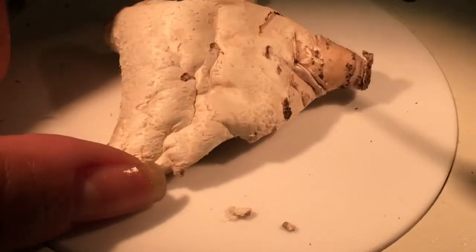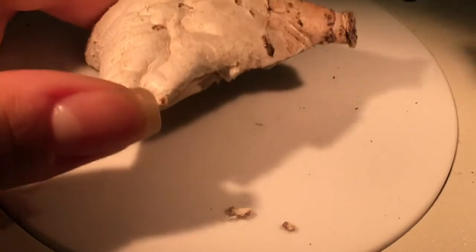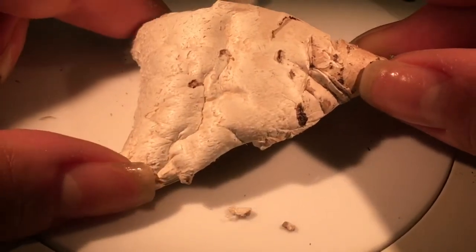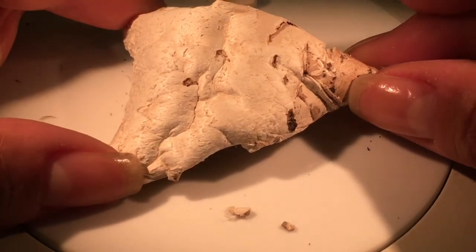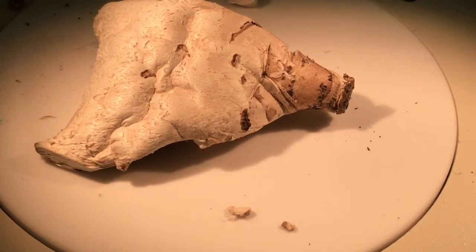In this tutorial, I would like to show you how I section the pileus of an agaric, or the cap of an agaric. And hopefully the techniques that I use here, you can apply when working with Amanita.